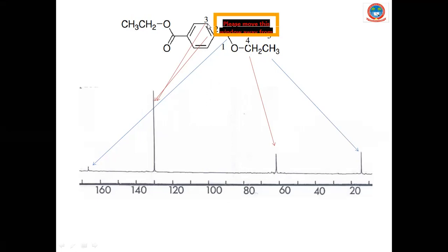But this third peak and second peak are coming from the aromatic ring, they are resonating or merging, overlapping of peaks takes place. This happens many times, and due to this overlapping there is a misleading about the spectrum. Just now we have experienced it. So expected peaks are 5, only 4 are appearing. To avoid this confusion, there is an invention of 2D. Remember, there is an invention of APT, there is an invention of DEPT, okay?